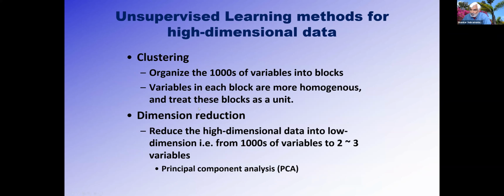Last but important topic, clustering. Clustering is one of the big things that we all do in large-scale omics experiments. We essentially try to take a large number of samples and group them together. Clustering is nothing but grouping. Imagine you have a box of red, green, and blue marbles, and you separate them into red marbles, green marbles, and blue marbles. That's clustering, right?